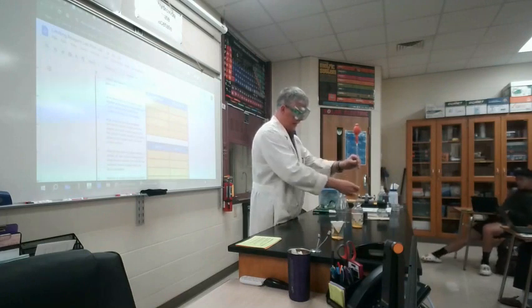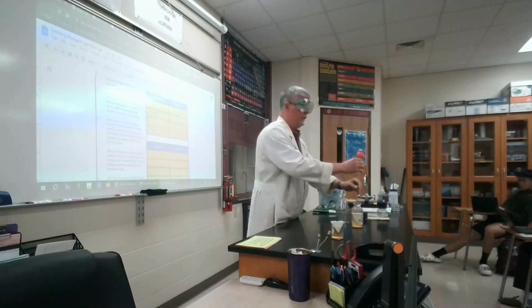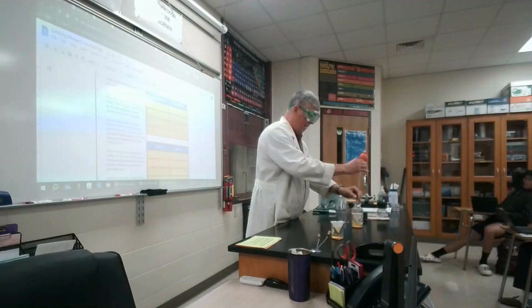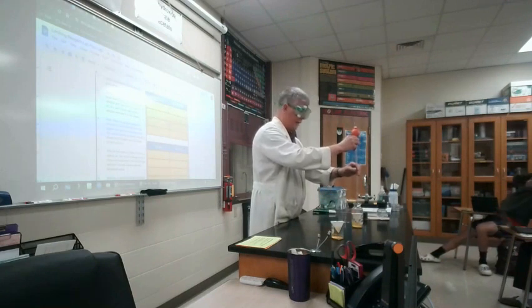And the last tip of here is accounted for. So you are emptying it out all the way until it is empty. If you need to pull up another 10 milliliters, you put it back in. You press this button. You get another 10 milliliters or whatever you need. You put it over your container. You hit the down button.